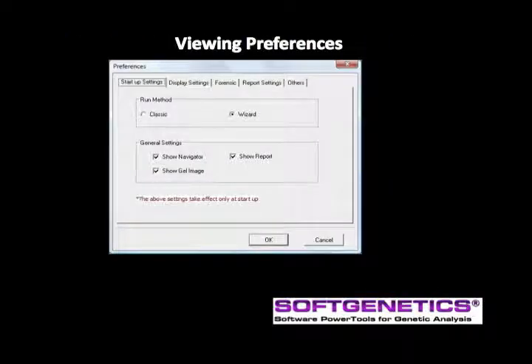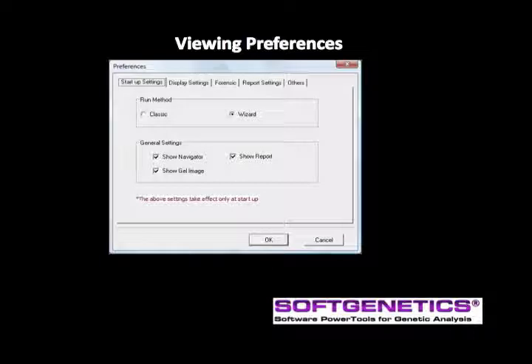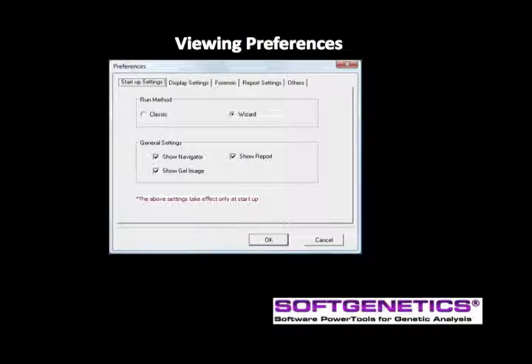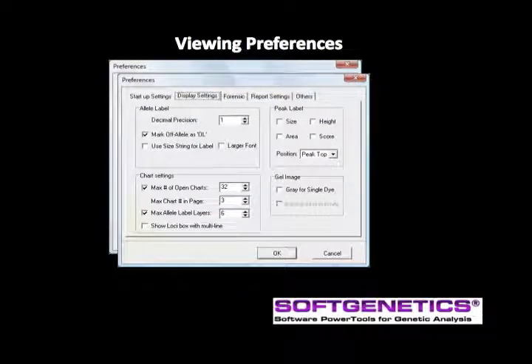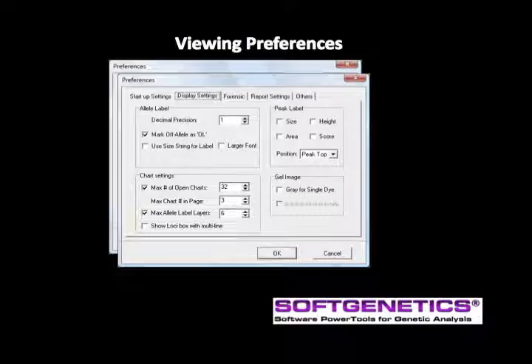Customize the main analysis window using view preferences. The startup settings are applied to the main analysis screen after restarting the program. For example, if you do not use the linked synthetic gel image, deselect it in the startup settings tab and it will not be displayed whenever the program is reopened. The display settings tab includes allele label, chart settings, peak label, and gel image options.